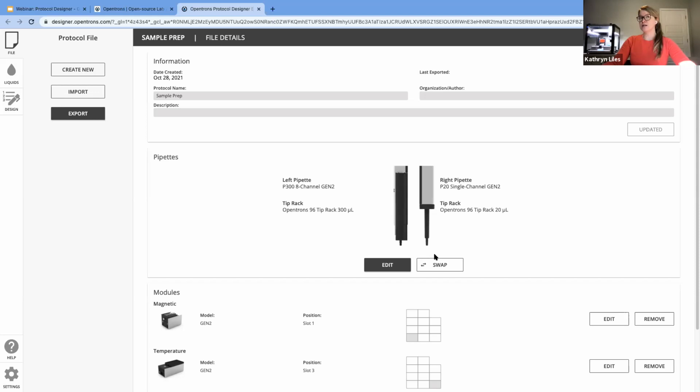That calibration happens prior to running a protocol, and it's not a current capability that can be modified in the middle of a protocol. So what we would recommend is that if you have a step where you need to change pipettes, you have one protocol for one configuration of your pipettes, and then a second protocol that uses the second configuration of pipettes.